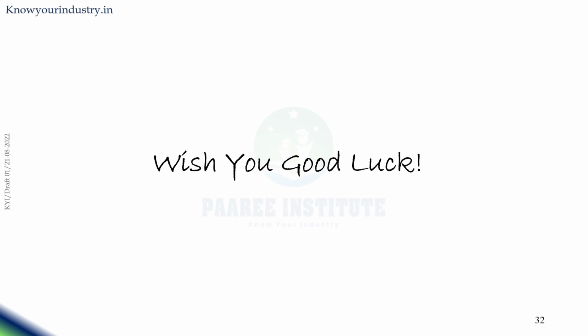So aspirants, in this module, we have seen the analytical laboratory infrastructure, including different areas of the analytical laboratory and how it is constructed, and we have seen the documentation requirements in the analytical laboratory, including calibration, validation, IQ, OQ, PQ documentation. And we have seen the composition of a wet lab, and what equipment is generally available in the wet lab or sample processing lab.